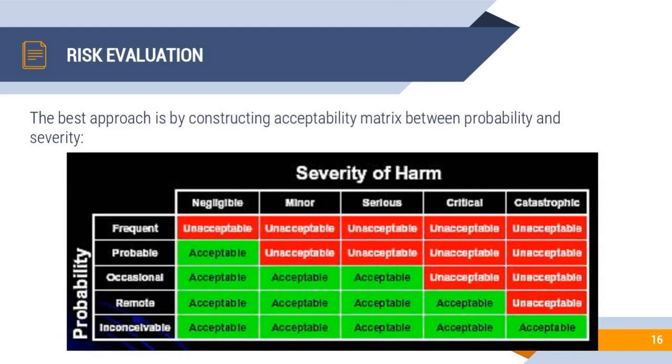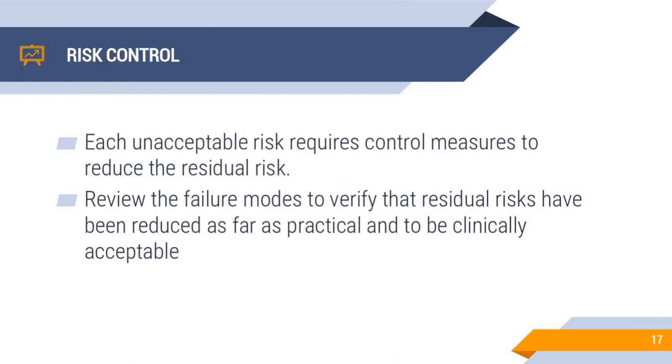But if it is occasional and negligible, then it is acceptable because it happens very rarely and it's not that severe to patient management. So this is how we monitor and evaluate the risk assessment. From this grid or matrix, we will do risk control.